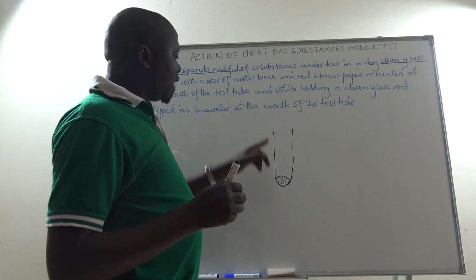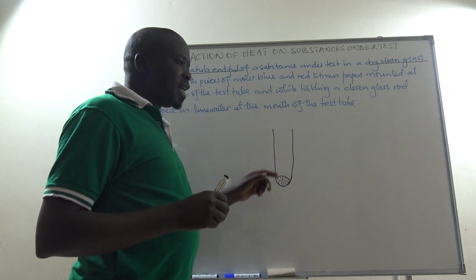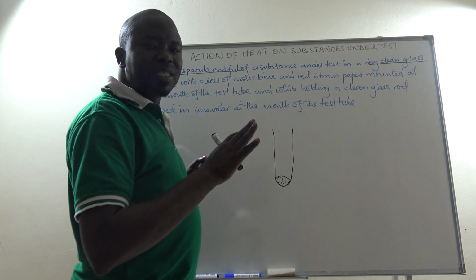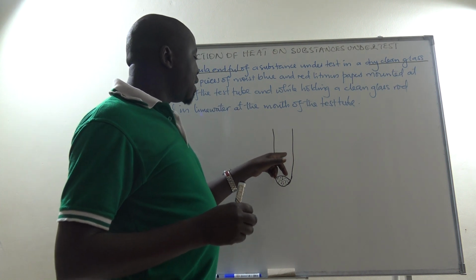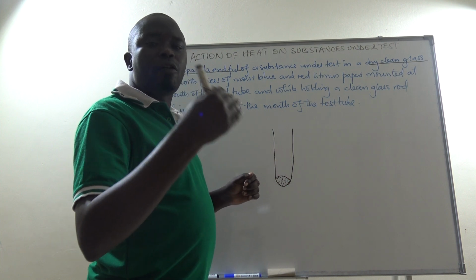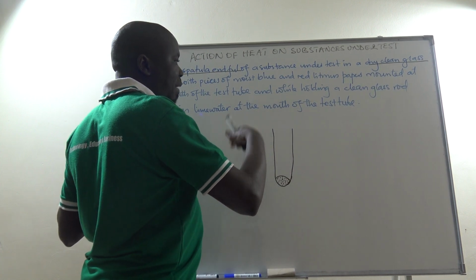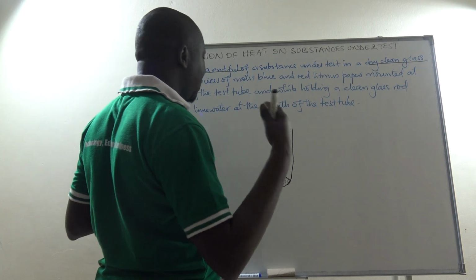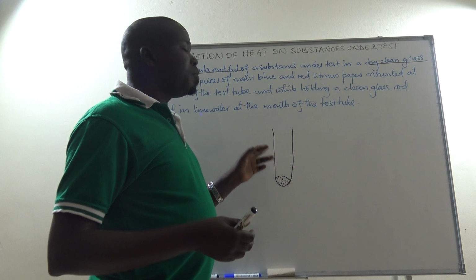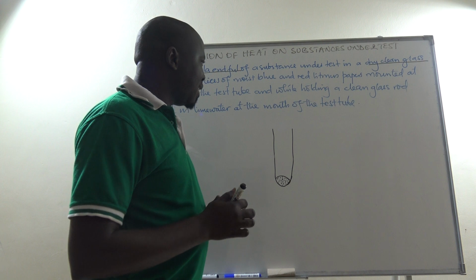And then two, it will take you a very long time to heat the substance and then make sure that you heat and make all the possible observations. So sometimes the heat may not be enough to make sure that the whole of that substance decomposes, if it decomposes and produces the substances or the products that you need. So you may not realize enough heat to make that happen. Therefore, don't use too much of the substance under test.